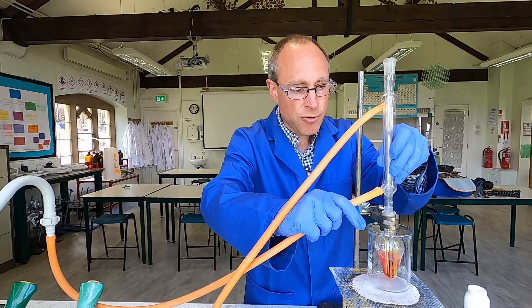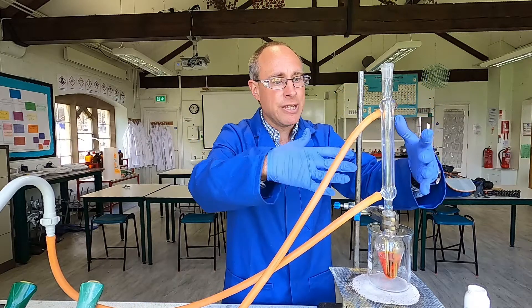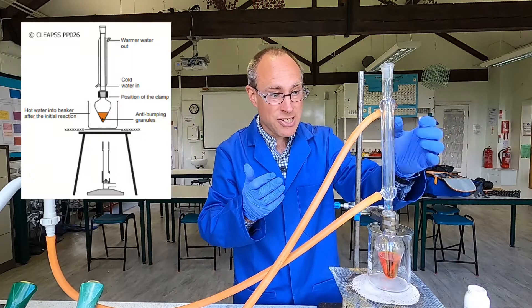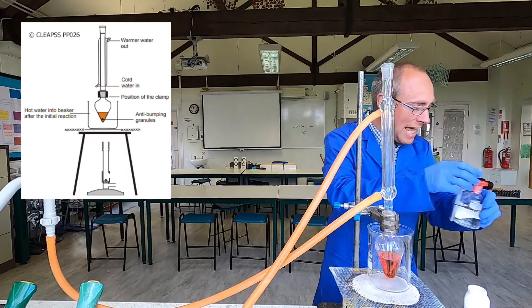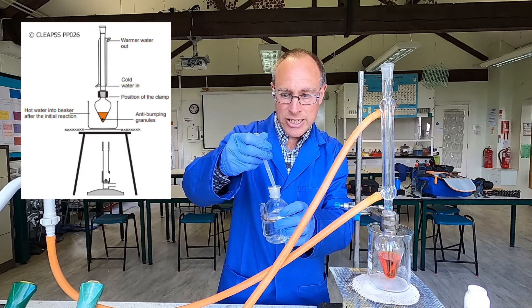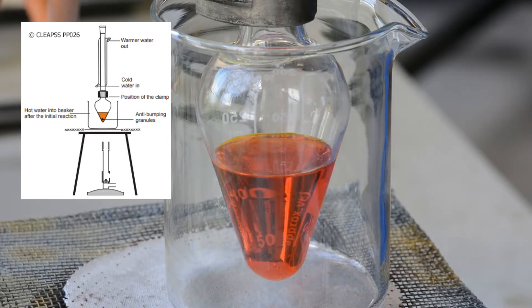I'm just going to assemble the apparatus for reflux. We've got the condenser with water coming in at the bottom, filling the jacket around the tube and coming out of the top. That condenser is going to be constantly cooled down. Before I start heating it, I'm going to add my alcohol. I'm going to use ethanol and add one centimetre cubed of ethanol, adding it fairly slowly down the condenser so that any vapours will be kept in the condenser.